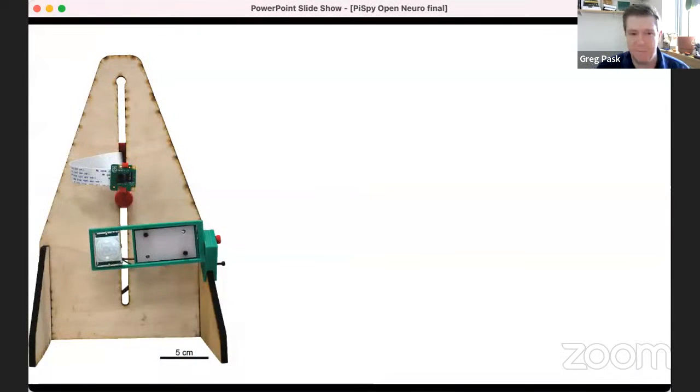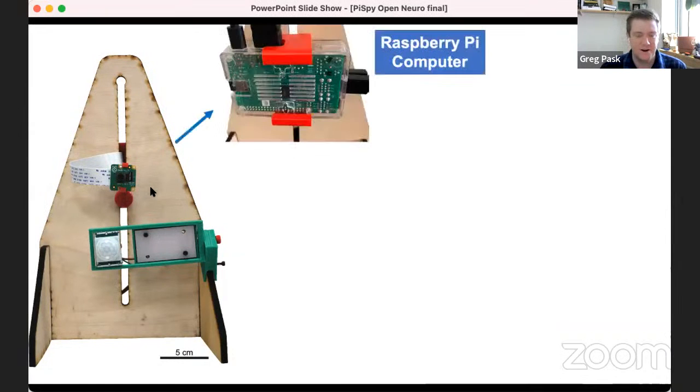And we ended up with a modified design here, still based with a lot of 3D printed and laser cut components. But this is our current model, our non-specialized model, which has the Raspberry Pi mounted on the back. There's a little thumb screw here that you can raise or lower however you want. And it's supporting it. We have access for all the ports that you'd need for a Raspberry Pi 3 or 4.